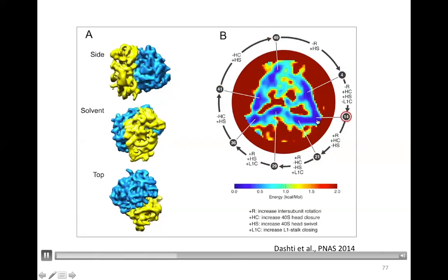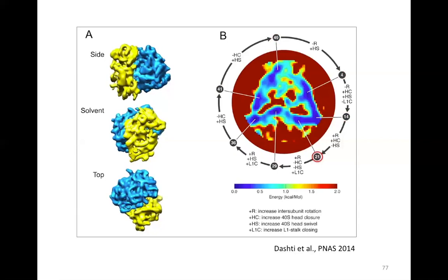and looked at how it was related to what was already known about conformational changes of the ribosome in the elongation cycle. And indeed, it looked as if the ribosomes, even without ligands, actually perform all the different conformational motions that would be required if they were to do their work in the cell. So this just gives you a glimpse of what can be done with this technique.